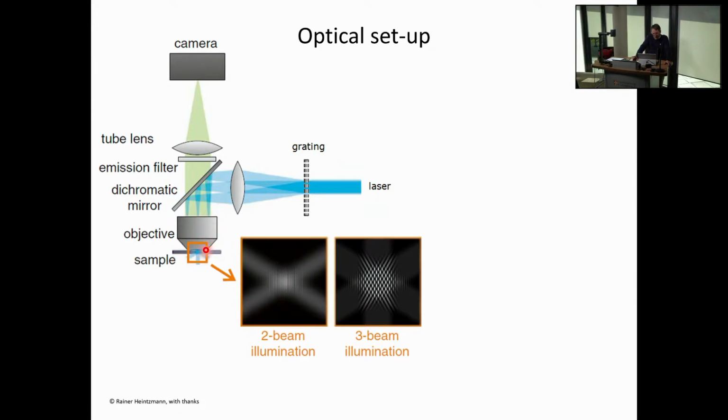And in the Fourier, on the other side, you get plane waves coming out because, you know, if you have a focused beam here, a focused beam 1 focal distance away will turn into a plane wave. So you get 3 plane waves corresponding to k +1, k -1, and k naught. And they cross in the sample to generate frequency beats. I think I might just quickly show this. So we have k1 going this way, k -1 going that way, interfering. And I quickly show this on the paper again, just so that this is clear how this works.